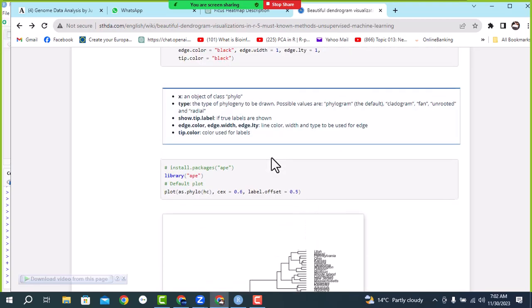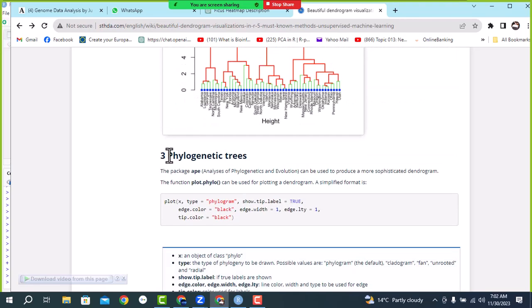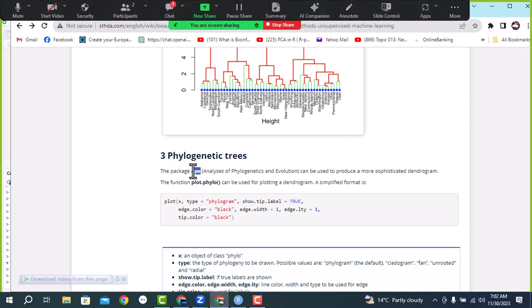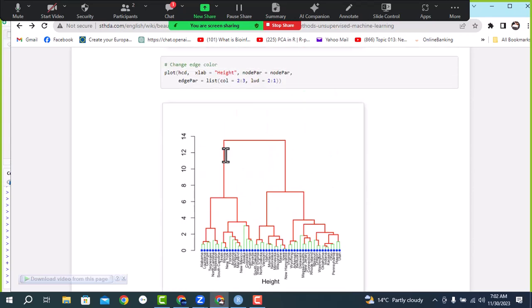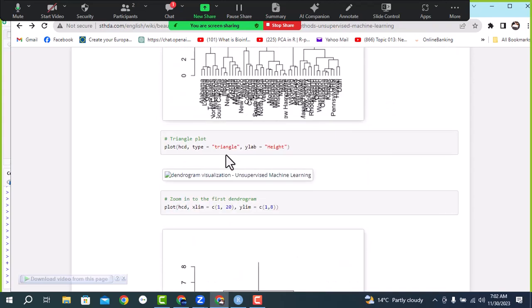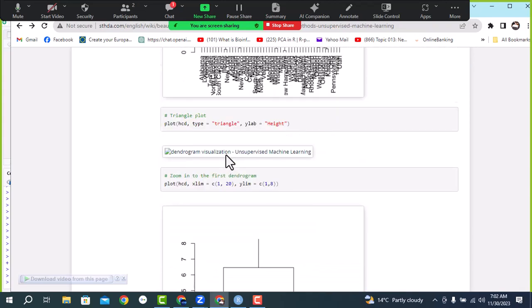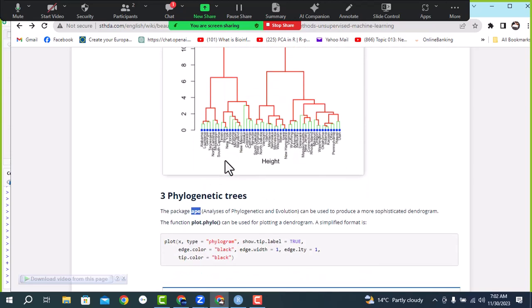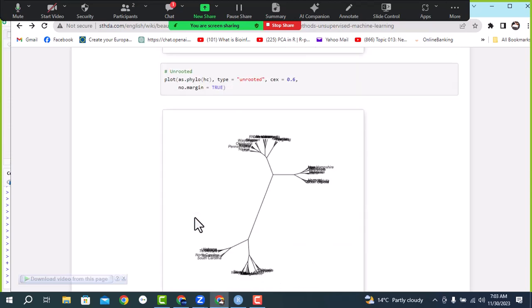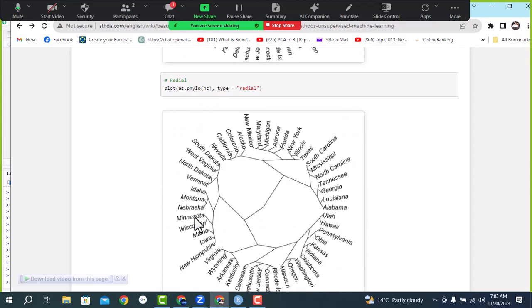For the phylogenetic tree, the third type of plot, you need a package called 'ape' to perform it. In our previous two types of plots we didn't need any package, but when we move to advanced-level plots we need a package. Here we use the phylogenetic tree with the 'ape' package, and for other advanced plots we also need different packages.